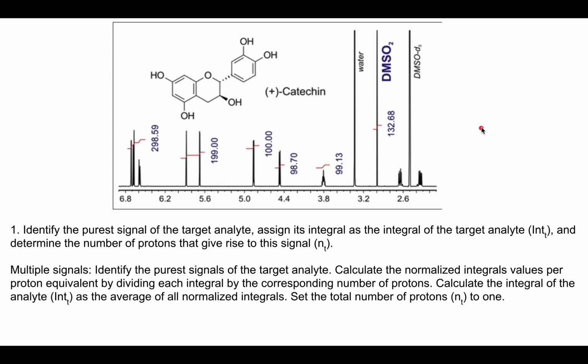With that information out of the way, this here is our brand new proton NMR spectrum. And unlike the previous spectrum, we see some solvent signals appear. One thing to note about the internal calibrant method is that the authors recommend the use of DMSO-d6 in order to dissolve your final sample in.